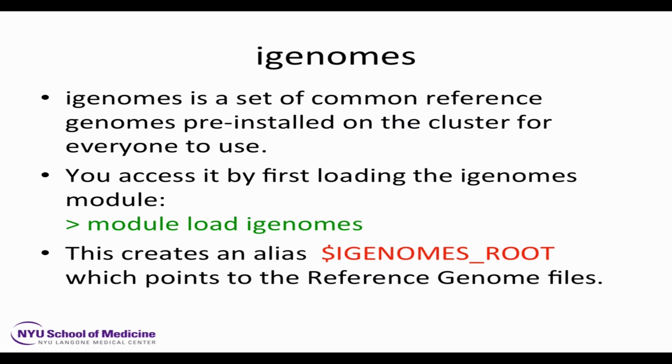One important module that we didn't go over yesterday is called iGenomes. I mentioned that in your alignment, you're going to take each read and map it to a reference genome. It's possible, following the instructions for the software that we're going to use, for you to download a reference genome from GenBank, UCSC, Ensembl, FlyBase, or whatever, index it, and use that reference genome in your personal account.